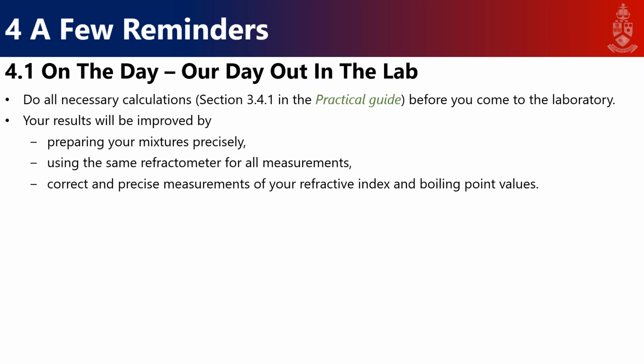Keep in mind that your results will be improved by preparing your mixtures precisely. Use the same refractometer for all measurements. So even if you work between groups or collect samples between groups, always use the same refractometer. Correct and precise measurements of the refractive index and the boiling point values are of utmost importance.